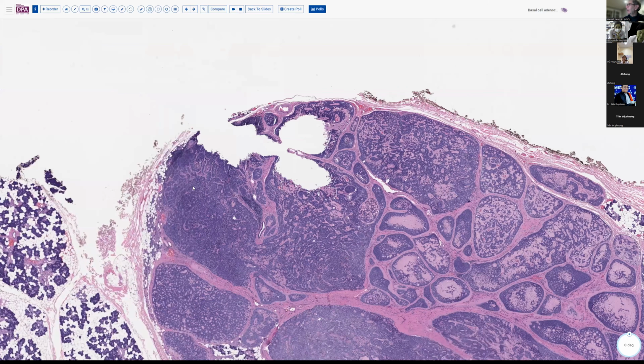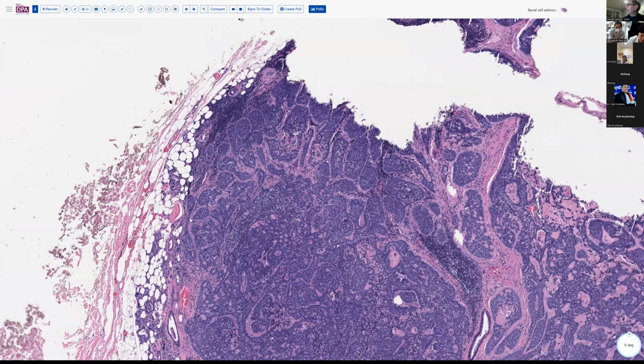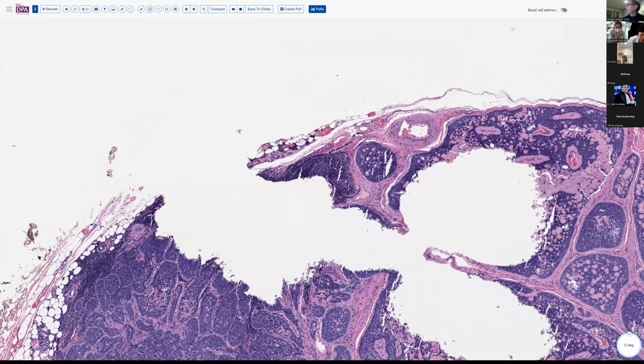Here we can look again here, and here again you begin to see a little bit more of this sort of infiltrative pattern of growth. It's not respecting a capsule here. It's not maintaining itself within that very closely, and here growing around a large vessel. So a little bit subtle, but a nice example of the kind of morphology and pattern, the piecework pattern.